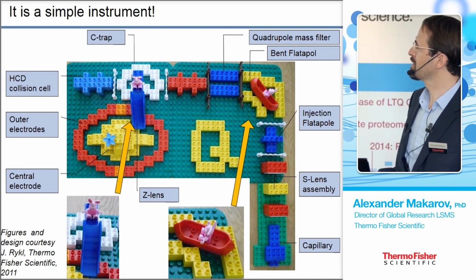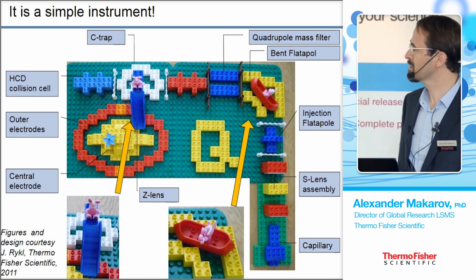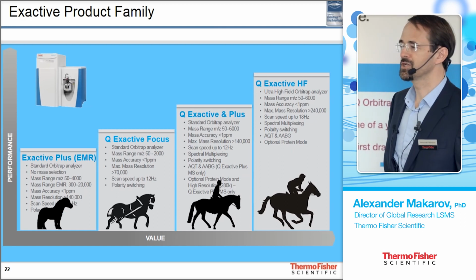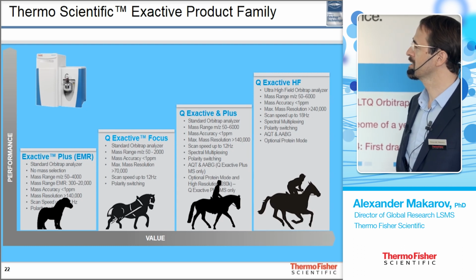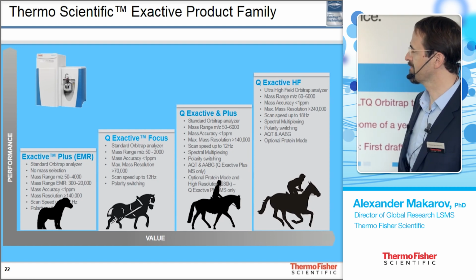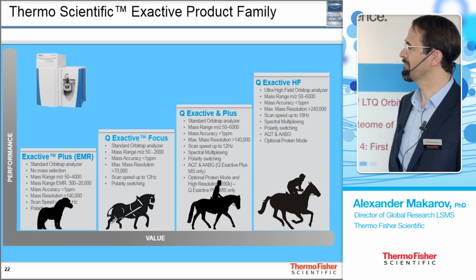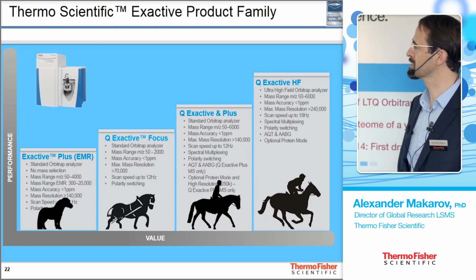And now you can see that the piglet is very anxious because now he has to go down. But he is pushed down, and then we listen to his oink oink as it travels inside the Orbitrap. So this was the original intention of this instrument, but since then we built on its success into a whole family, which Ken showed before, but I had liberty to add these pictograms to show how we could consider these instruments. So our Q Exactive Plus, in fact, grew up to address not only piglets, but also huge elephants in the form of protein complexes.